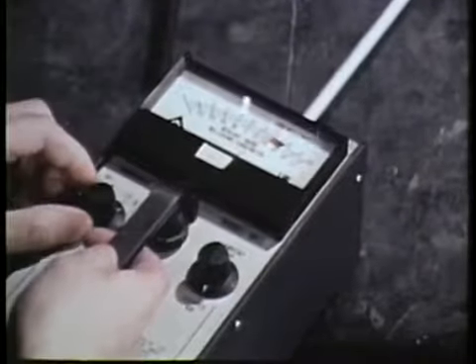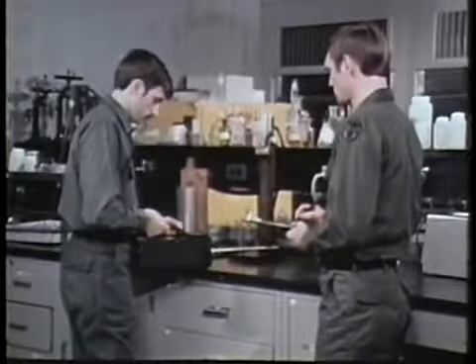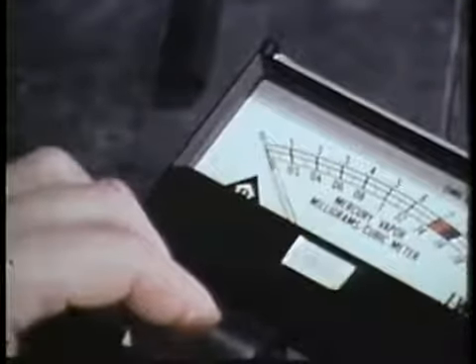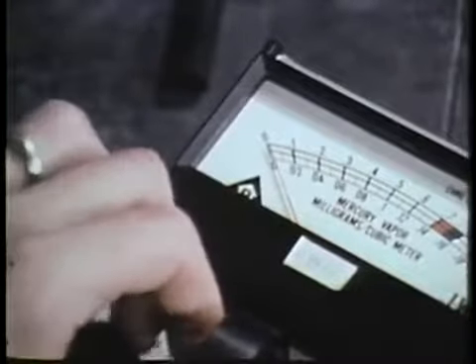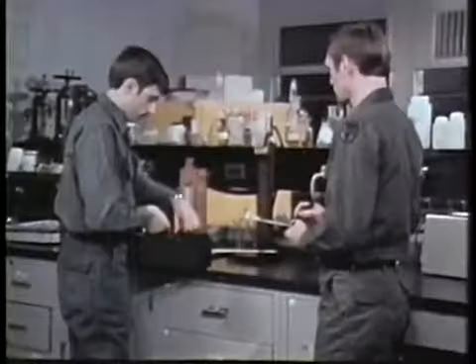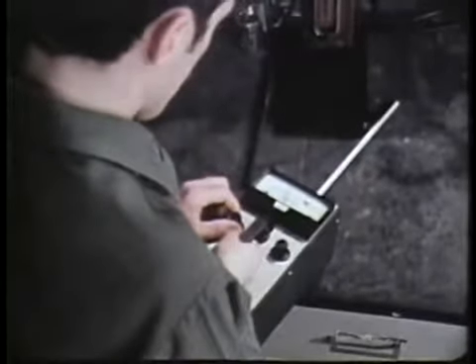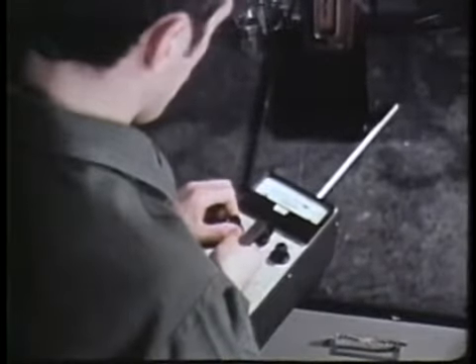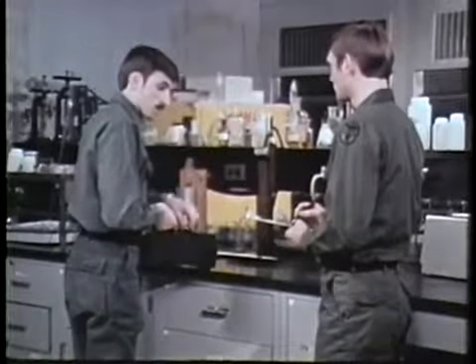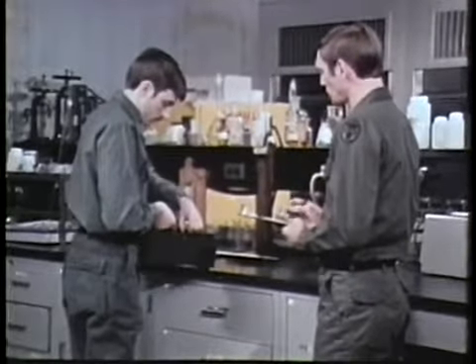Wait for the needle to drop to 0. Reset the zero adjustment if necessary. Shift back to ambient air and take another reading. After locating the source of the vapor, clear the instrument by shifting back to the filtered air position.